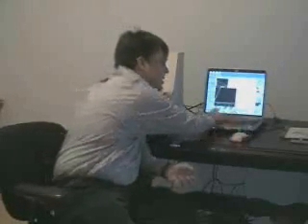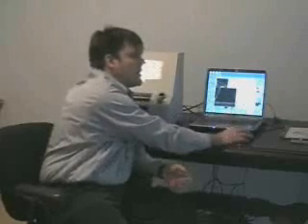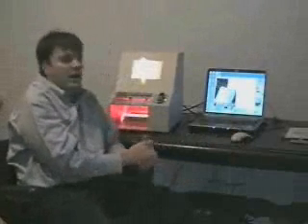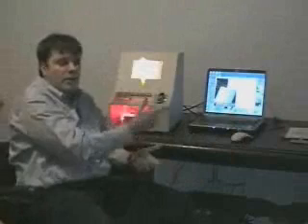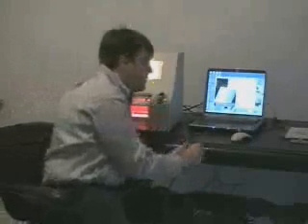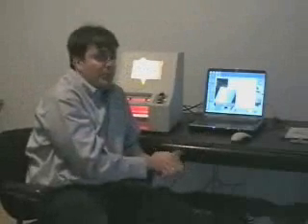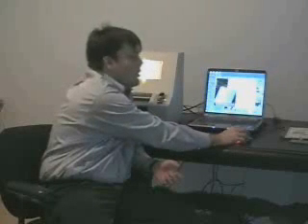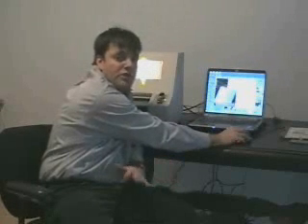I'm going to unclick Calibration Mode and change COM port to 4, and then click on Calibration Mode. That's not it. And I'll try 5, and I'll click on Calibration Mode. And there, the machine turns on. So I know that COM port 5 is the correct port for the USB cable that I plug in to control the Pillgrade machine via software. Once I've got the correct COM port specified, I quickly uncheck Calibration Mode, click on OK at the bottom of the screen without changing anything else.